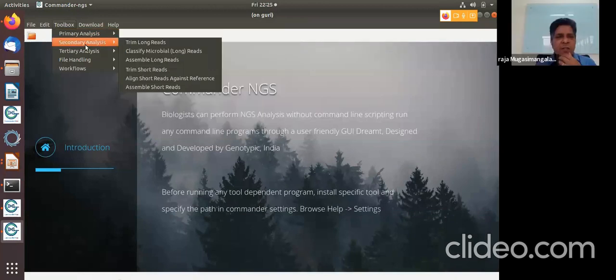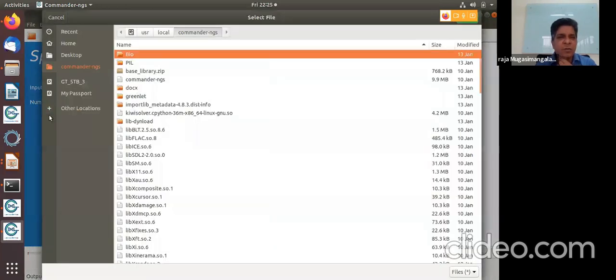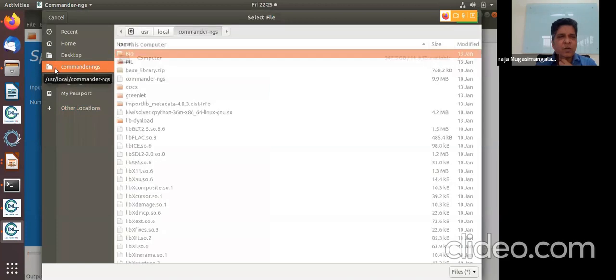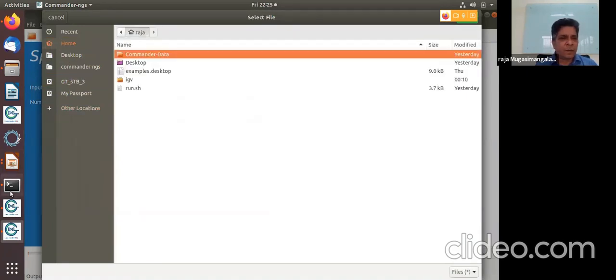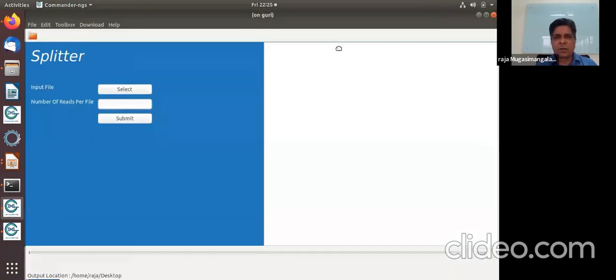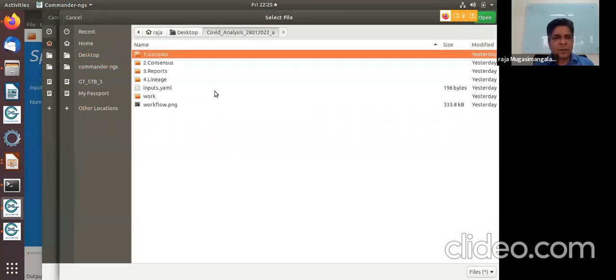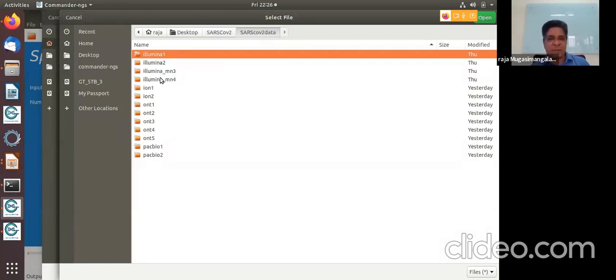So I'm going here: primary analysis, secondary analysis, file handling. I want to split FASTA files. Okay, so let me go to one minute. Let me also go here. Yeah. You can go to desktop. Which one? Desktop. This desktop? Okay, thank you. It was going into my computer's desktop. Okay. Where is it in the desktop? This is COVID analysis. This FASTQ I can use, right? Okay, I'll use the same file. Thank you, Anand. So this is Anand, by the way.